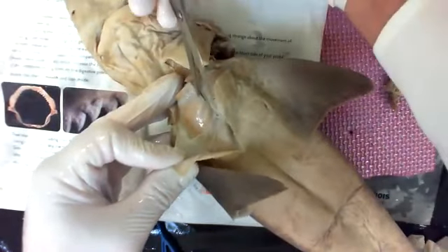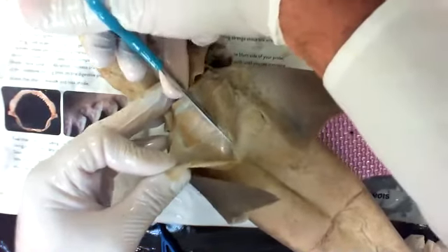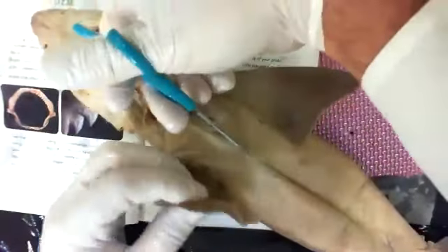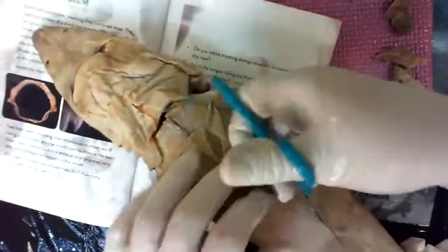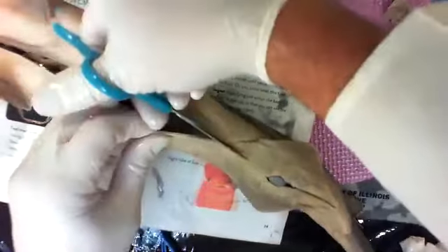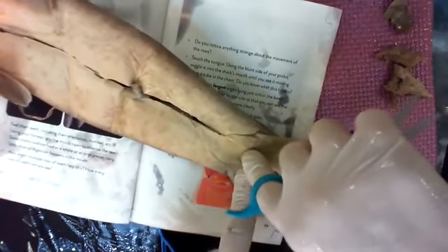I'm putting scissors in because now I'm in the abdomen. Putting the scissors in, pulling it up because I don't want to cut any organs. And I'm just snipping, constantly pulling it up like I'm actually holding the shark with the scissors and snipping. Snip, snip, snip, snip. Hearing my scissors get dull with every cut because of that sandpaper skin. Snip, snip, snip, snip. Coming on down. Going all the way down to the cloaca, the little hole down here. And it's going to get hard to cut right around here because here are the pelvic fins, which is like the hip, remember? So you actually have pelvic bone-like structures here that connect.